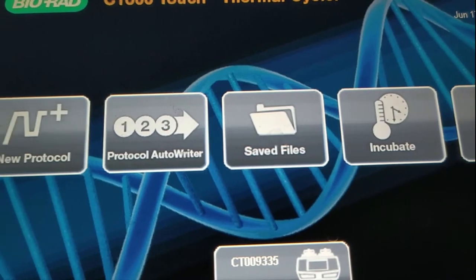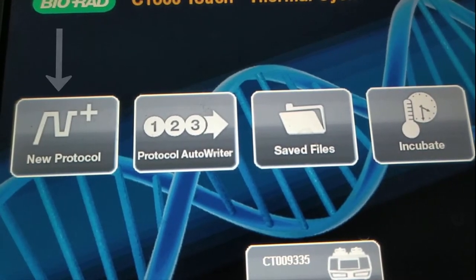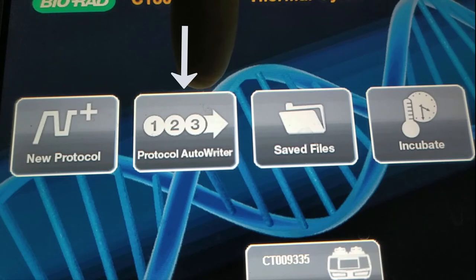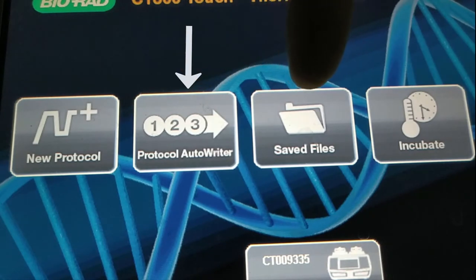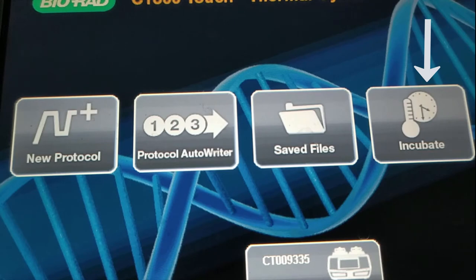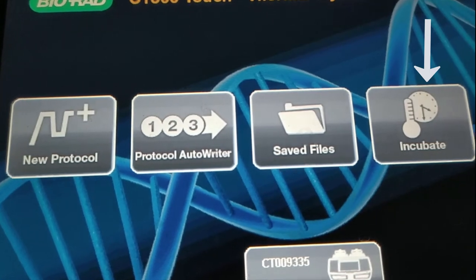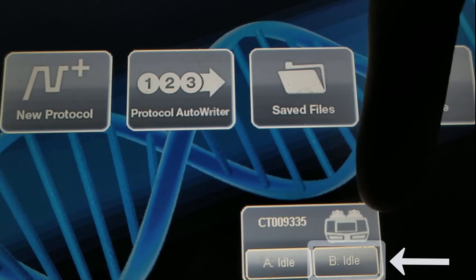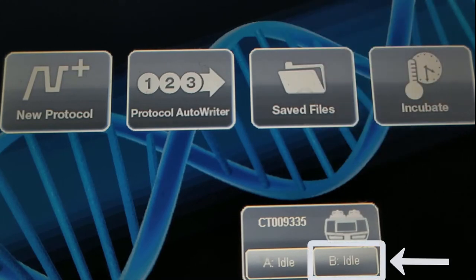Okay, so from this menu you can see that we have the option to start a new protocol. We can write the protocols in the automated way. We can also use the protocols saved from the previous sections. And finally we have the incubation. Also we have the choice of the blocks. In this case we will be using the block B and when we set up the program we will need to indicate that we are using the block B. Now it says that it is idle.